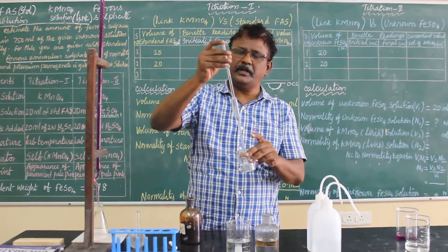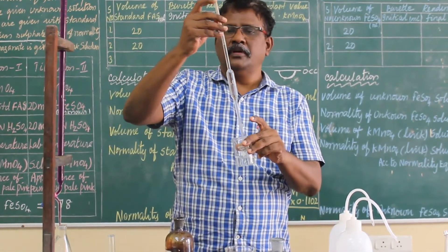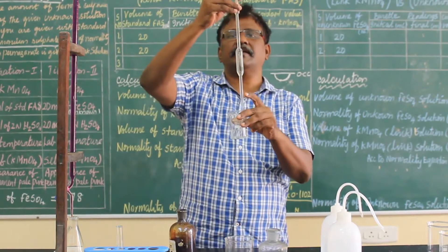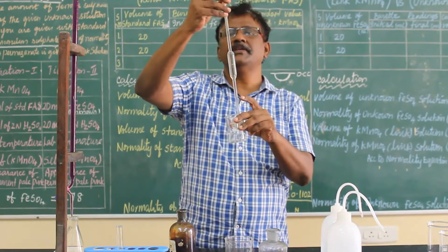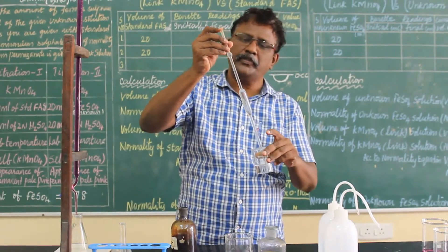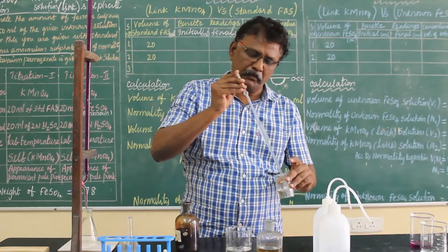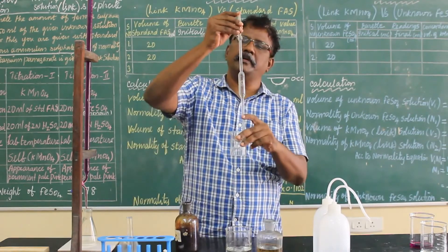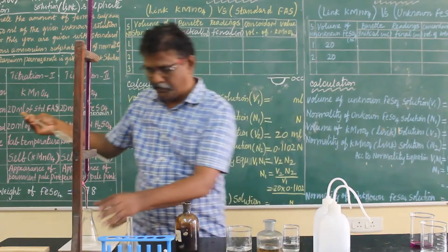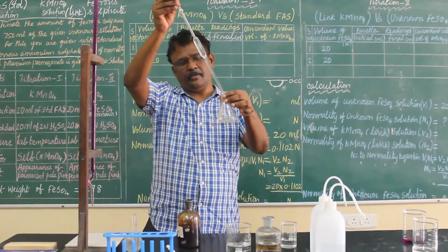You have to tilt slowly so that the solution comes in drop by drop into the beaker. Come to the zero CC mark, then slowly take it up. Now it is exactly 20 CC — take it out and pour it into the conical flask.